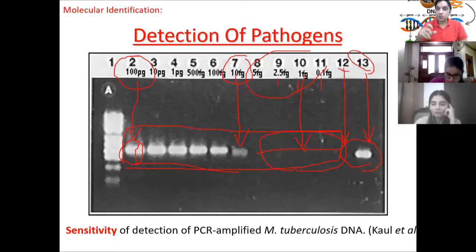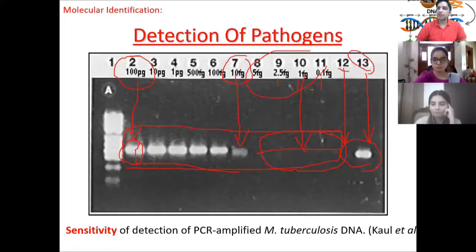So I will put a positive DNA as a positive control. I will put the same DNA of the SARS-CoV-2. SARS-CoV-2 is an RNA virus that will be converted into cDNA. And I will put the known sequence in one tube. It is certain that it will amplify, because we have put it in ourselves.